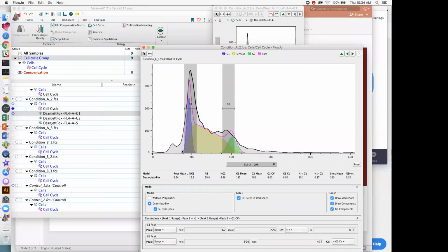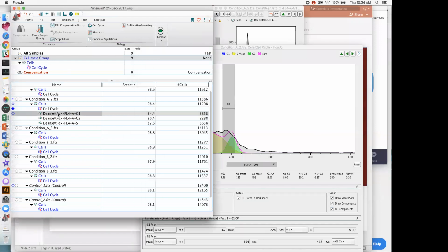Again, the model is working with a probability of cells being in one population versus the other. It's assuming essentially a Gaussian distribution of events for the G1 and G2 phases, and I mentioned earlier whether it's a subtraction or a polynomial with respect to S phase. So don't expect these gates, right, to reflect the percentages that you see over here.